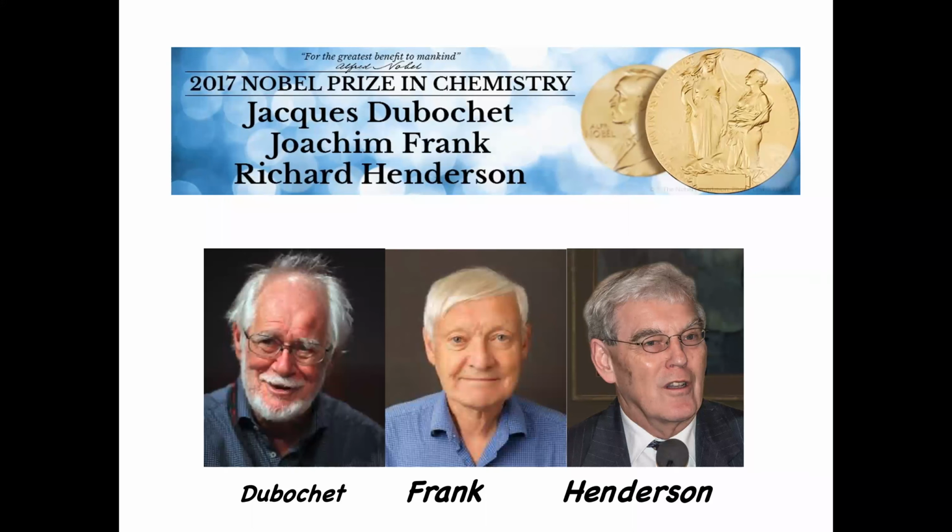And the same method was actually also used for data collection by X-ray diffraction from frozen crystals. Joachim Frank was the person who pioneered the idea of using computer analysis to combine images of particles or molecules oriented in different orientations.